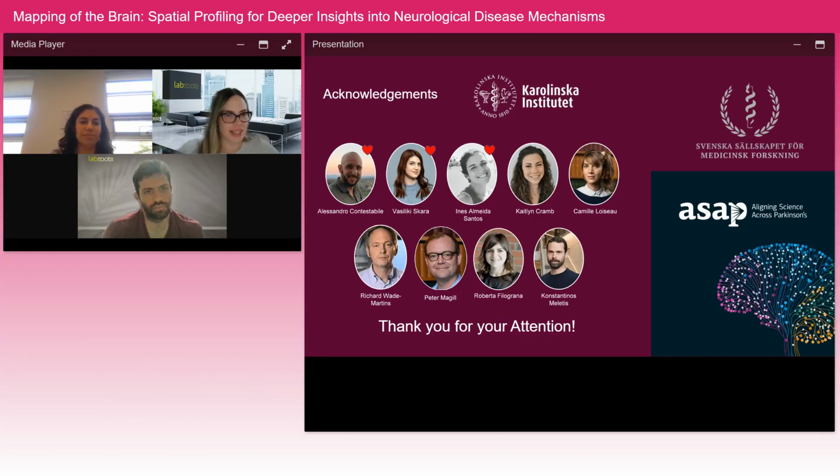All right, Ioannis, this next question is for you. It says, how consistent was the vulnerability signature across the different Parkinson's disease models examined? That's an important question, actually, but it depends how you say Parkinson's disease models.